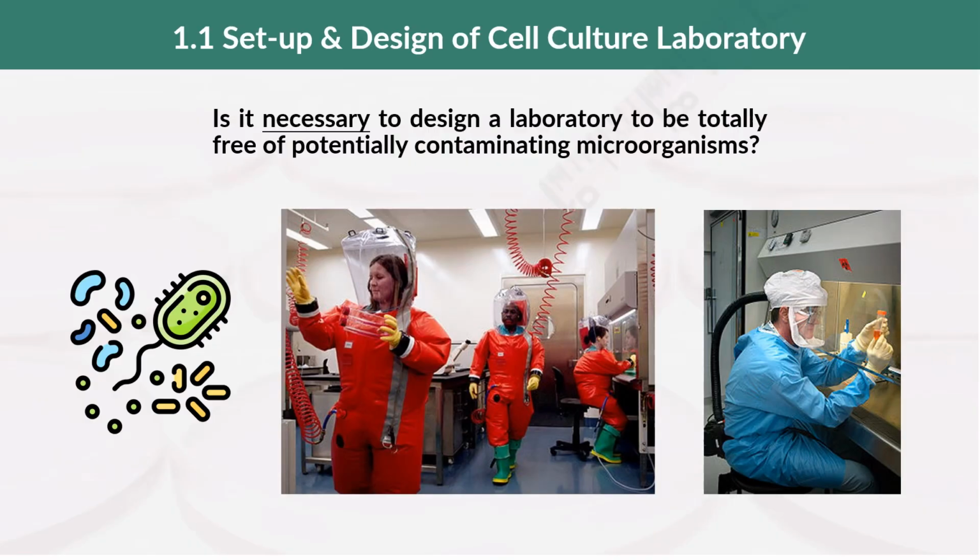So if we researchers are working in a mammalian cell culture laboratory, do we really have to totally gown up like the pictures shown here? Is it really necessary to design a lab to be totally free of potentially contaminating microorganisms? Is that even almost possible? What do you think?